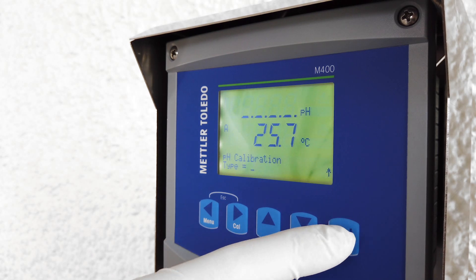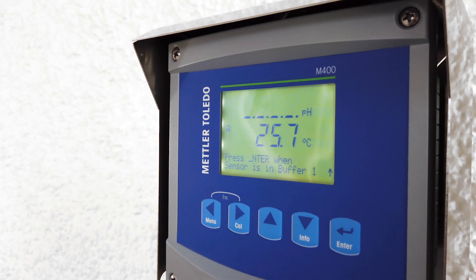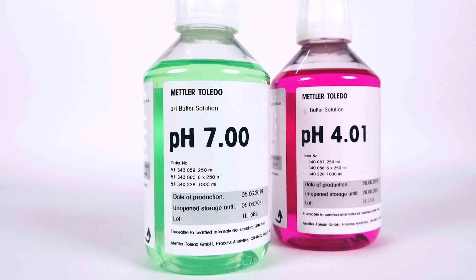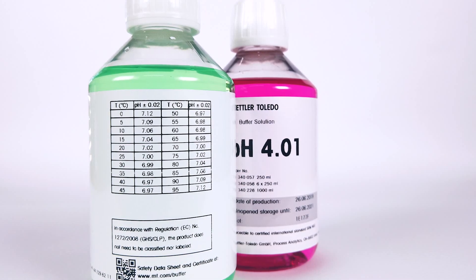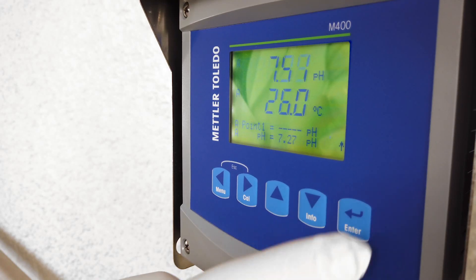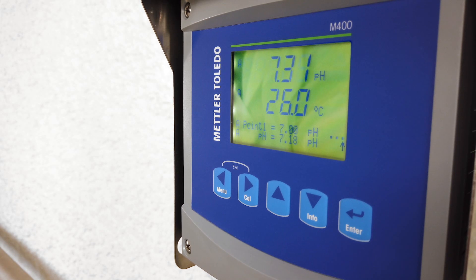The transmitter display indicates that the sensor should be put in the first buffer. Mettler Toledo transmitters can automatically detect buffers, as they have a Mettler Toledo buffer table preset on them — pH 7 or pH 4 first; the transmitter will automatically detect which one it is. In this case we're using pH 7 buffer first. Press the enter button and on the screen you will see that it's detected pH 7 buffer and it's calibrating the first point.